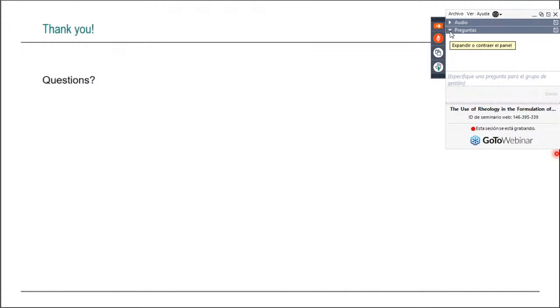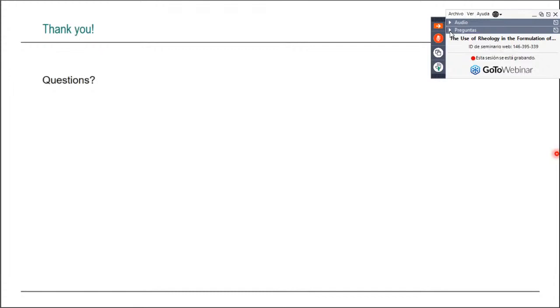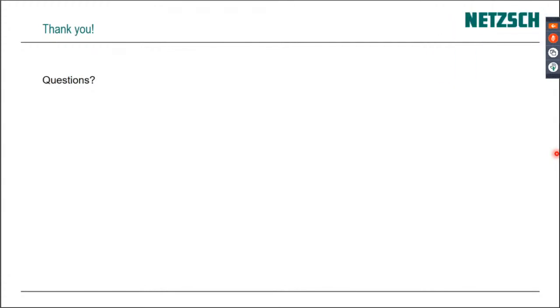Certainly. So the first question is, which parameters should I take into consideration when I want to decide how long I wait for the sample to regenerate the inner structure after loading before measuring? That's a good question. And I think when you're considering any parameters for any rheological test, it's good to consider what you're characterizing and why, and then maybe to try to simulate that event.